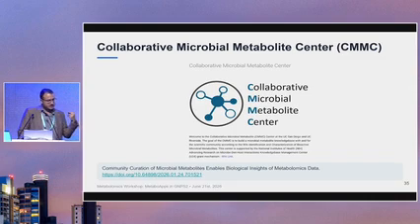But if you're just using the web version, it doesn't mean it's going to be public. That's not what I'm trying to say. Is that the more information you can provide for public repositories, the more information we're going to have to implement on those tools. And of course, more discovery, fortunately, based on that.